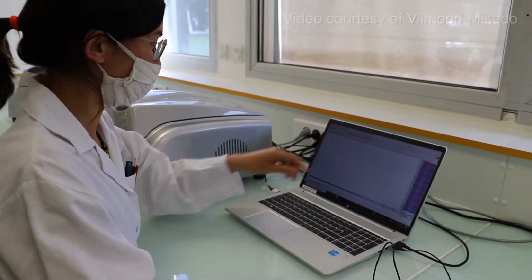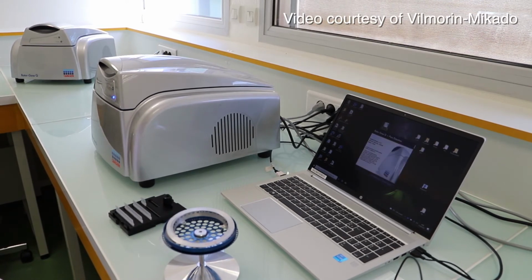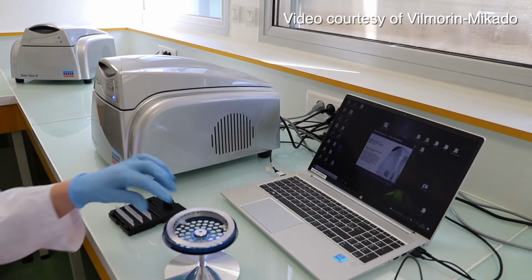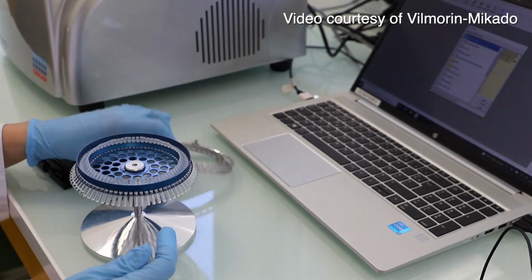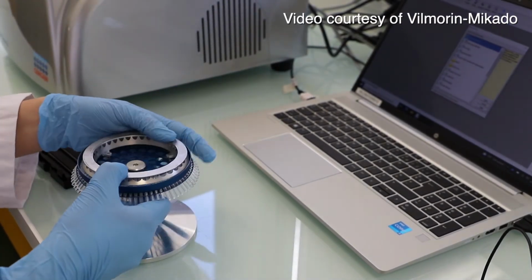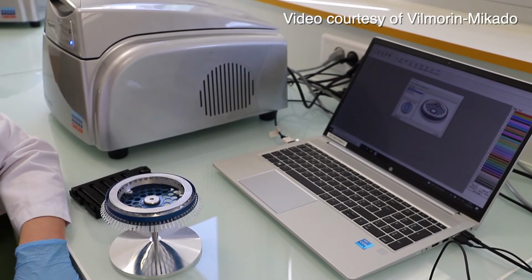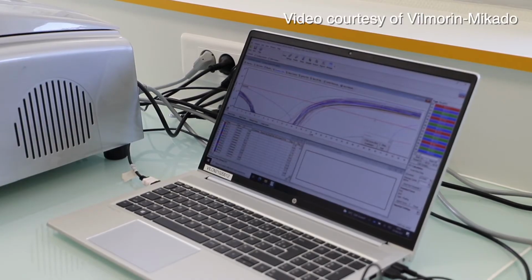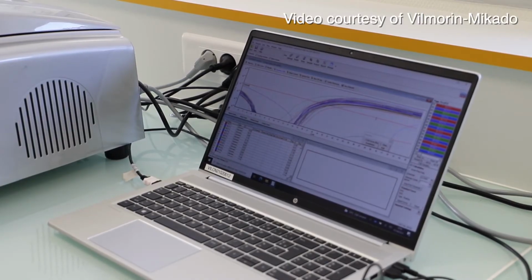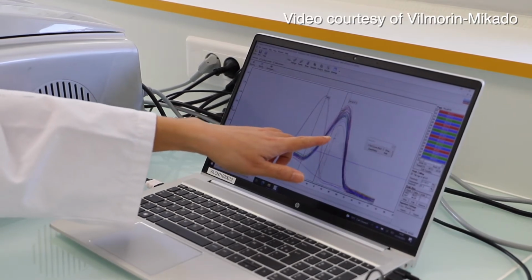So the objective of this project was to show that the new qPCR assay accurately identifies suspect isolates. So the aim was for us to validate it before including this new assay as an optional step in the current protocol. To do so, we had 2 tasks. First, to gather all data generated within the lab during the developmental stage. And then the second task was to organize a comparative test between 5 laboratories.